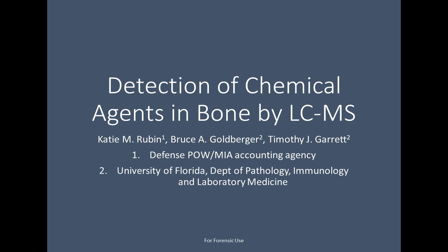How often did you have to clean the MS instrument over the course of the study? That's a two-part question. And were there any concerns about the inorganic organics getting into the instrument, affecting the instrument performance? Yes, that's an excellent question.